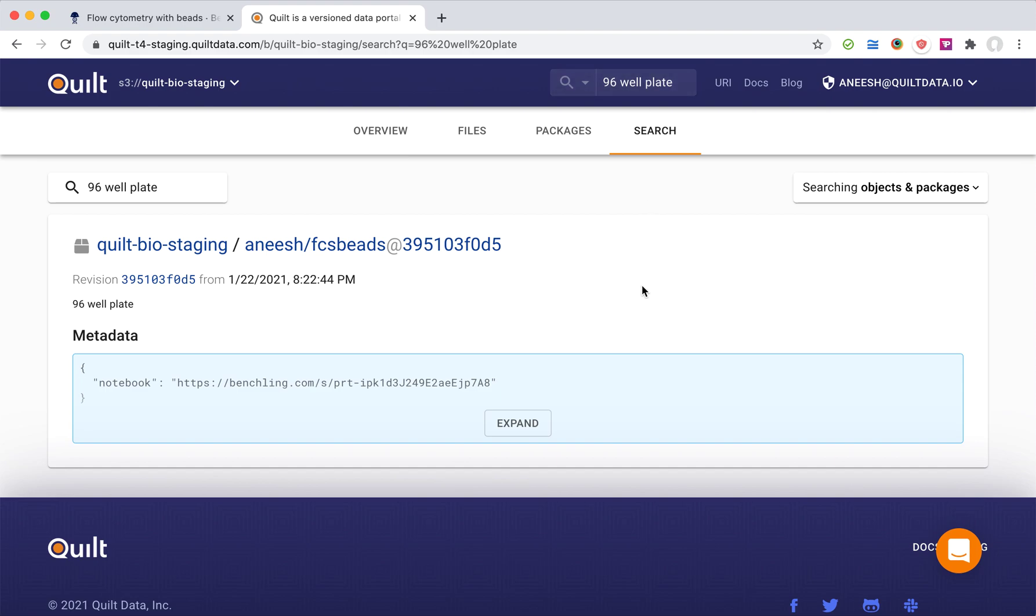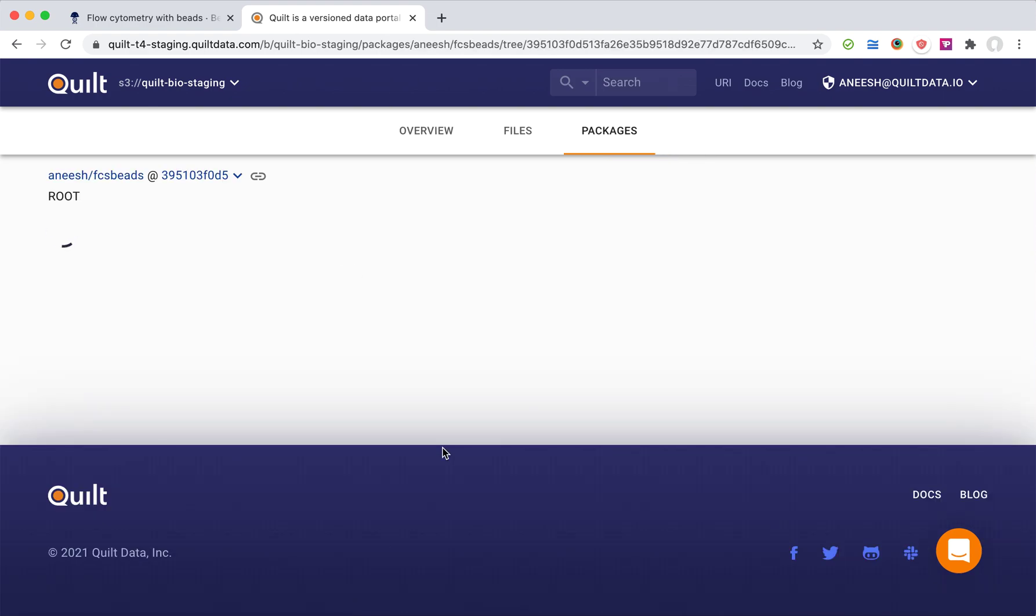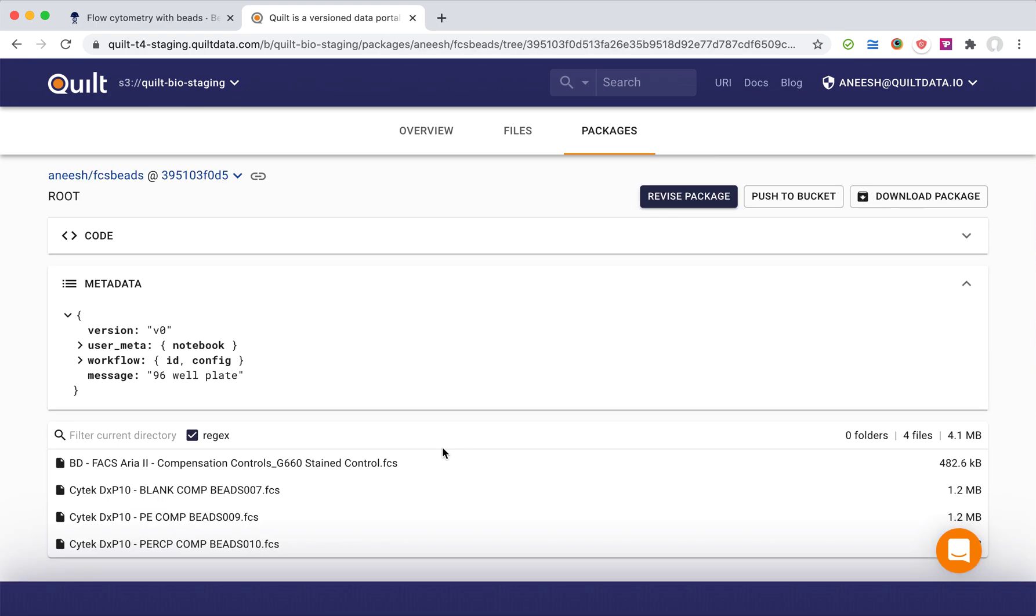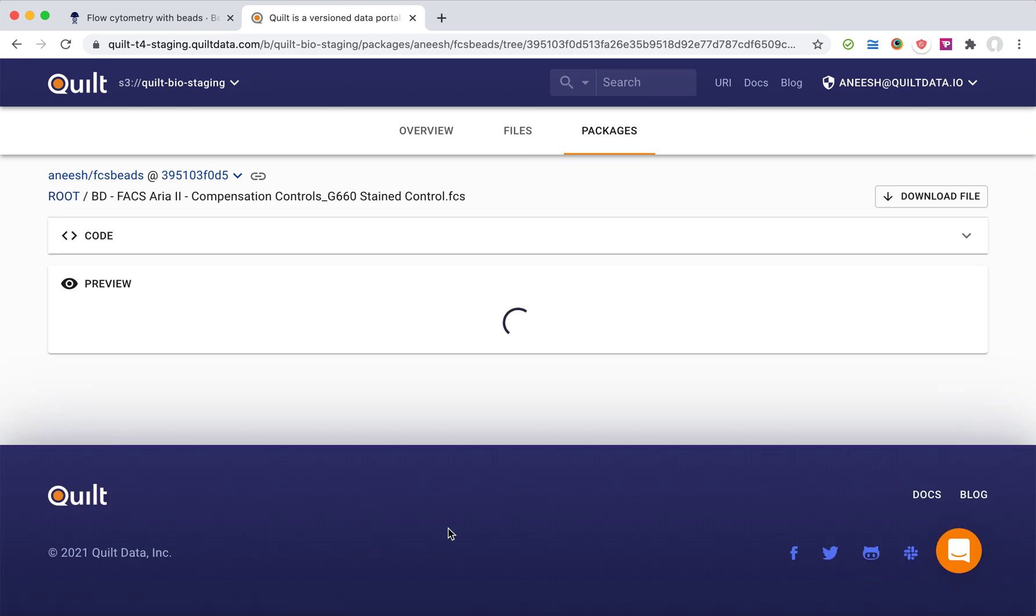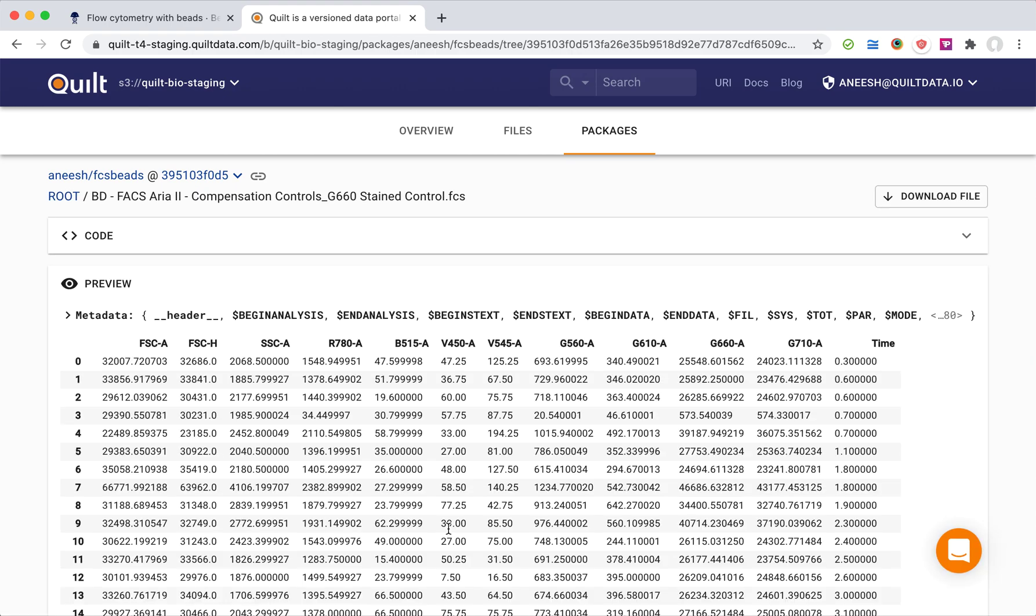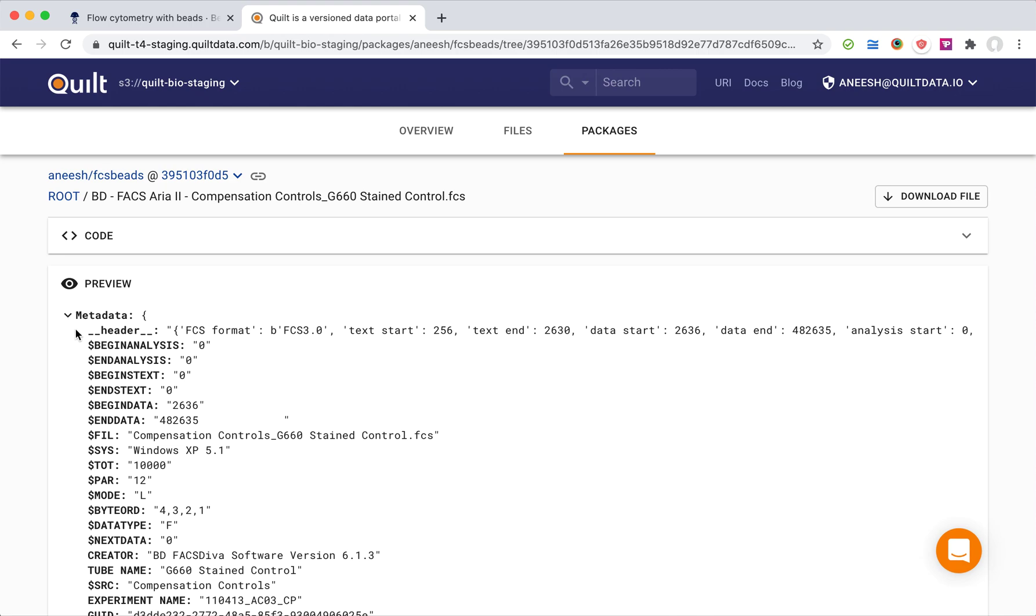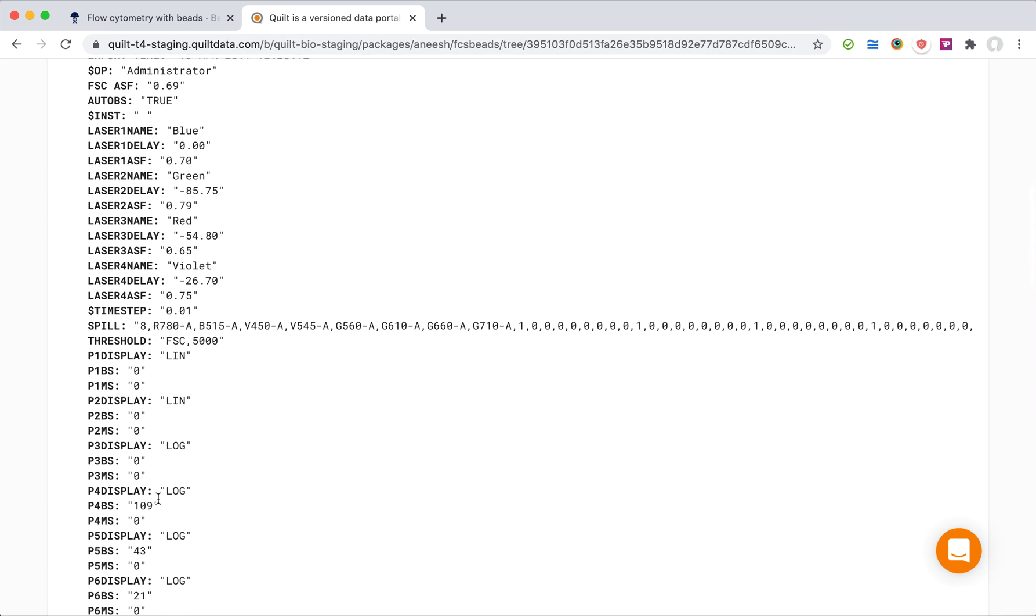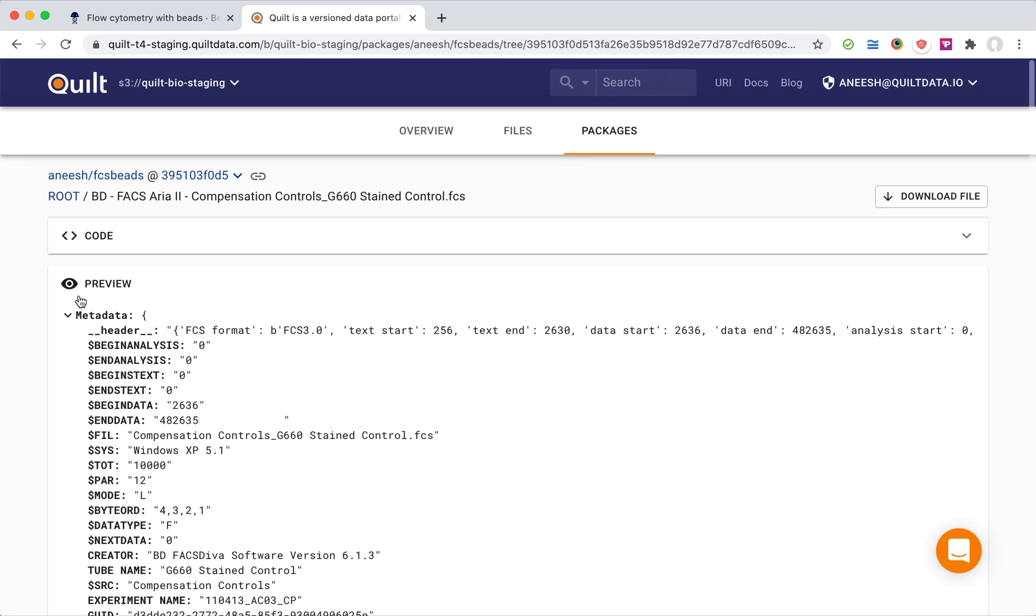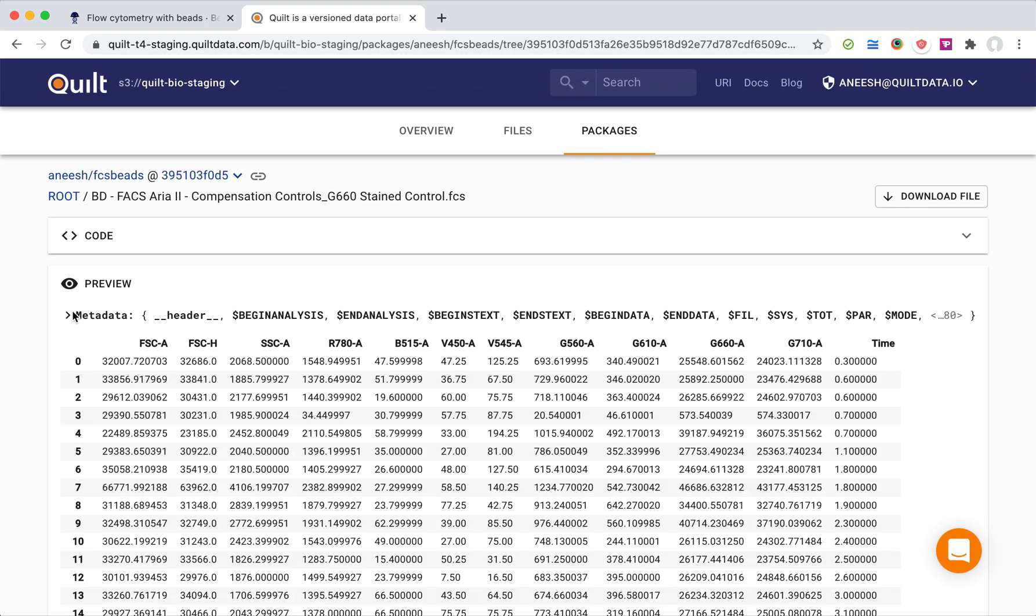I see the link to the Benchling notebook here, and I can of course open the dataset. I can even browse the data, I can look inside the FCS files, and I can see laser configurations, compensation data, whatever I'm interested in.